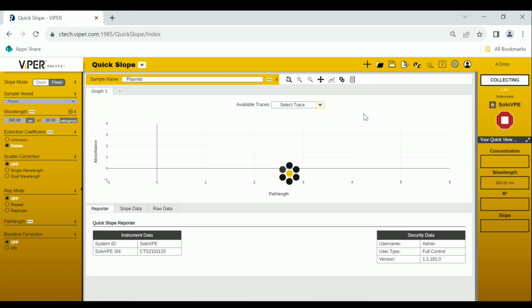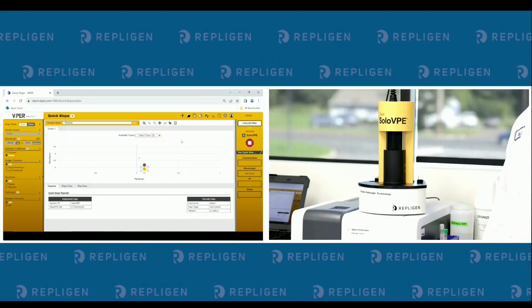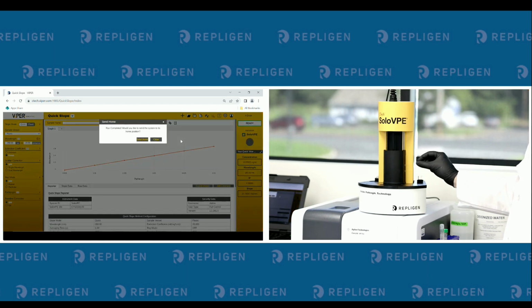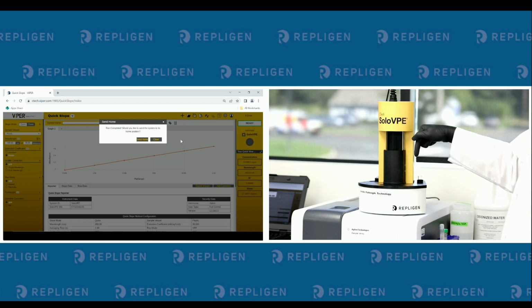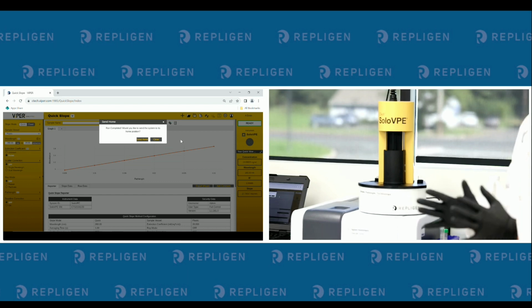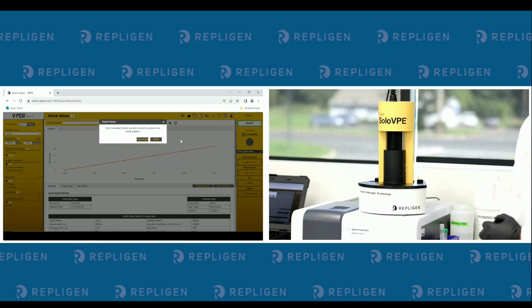And I guess I'll take some time right now to explain why I pushed up on that silver piece after I put the fibrette in. So the Solo doesn't actually have a sensor in here, so we need to make sure that the fiber optic glass rod, the fibrette, touches the bottom without having a sensor. So when we push up on that silver piece, we're actually pulling the fibrette down, so when it touches the bottom, the fiber optic line stays loose and it won't get crushed.